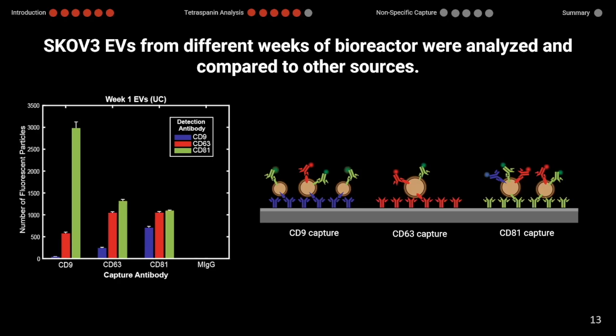This fluctuation is probably because we were getting fewer and fewer EVs that we were actually looking at. At those lower concentrations, we were looking more in the hundreds of particles. So we didn't have as tight of an idea of what the actual population was. That's why we got those different fluctuations, just because we weren't getting as great of a number total.